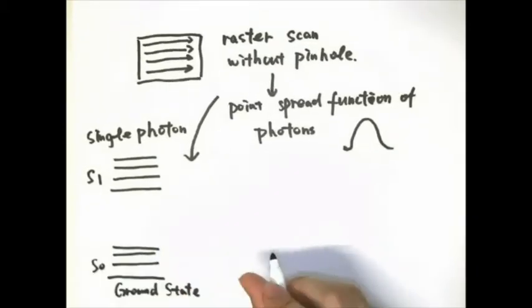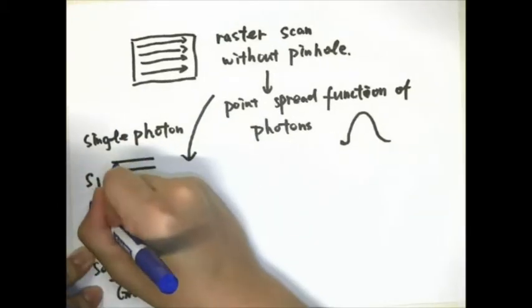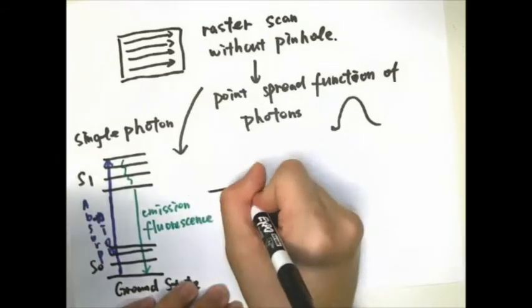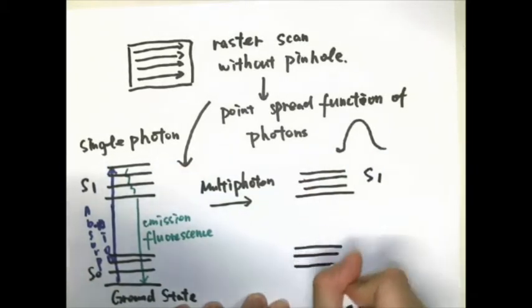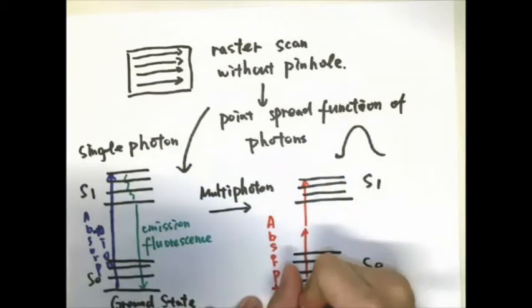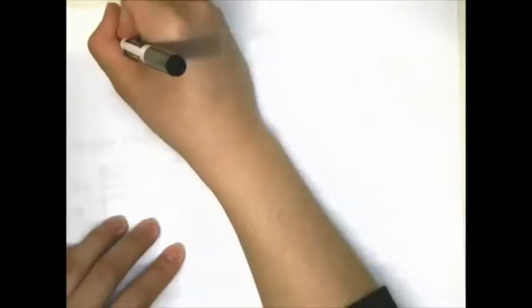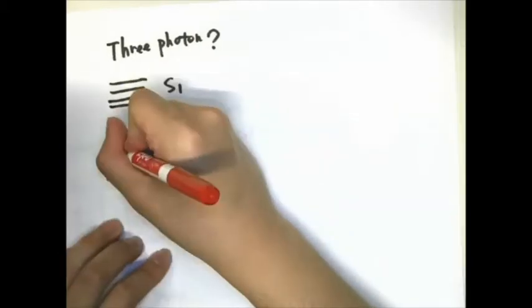In single photon excitation, only one photon is absorbed by the fluorophore, which then emits a fluorescent photon that typically has a wavelength slightly higher than the single photon, with less energy. The concept of two-photon excitation is based on the idea that two photons of comparably lower photon energy than needed for one photon excitation can also excite a fluorophore in one quantum event. Each photon carries approximately half of the energy necessary to excite the molecule. An excitation results in the subsequent emission of a fluorescent photon, typically at a higher energy than either of the two excitatory photons. It requires that the two photons reach the molecule simultaneously.